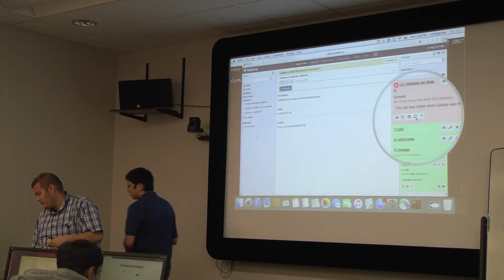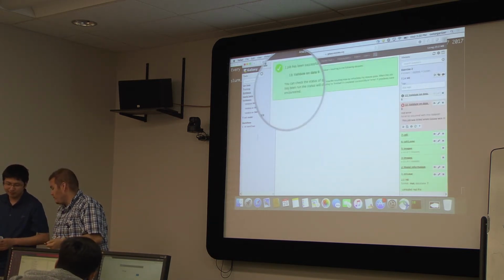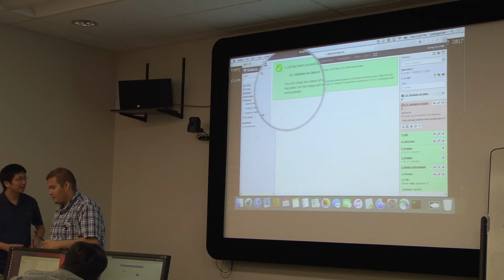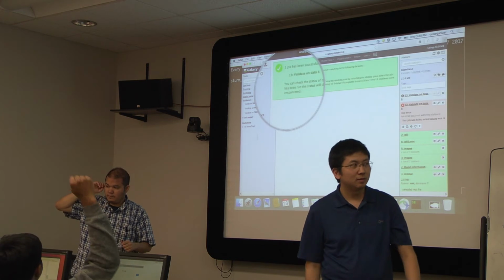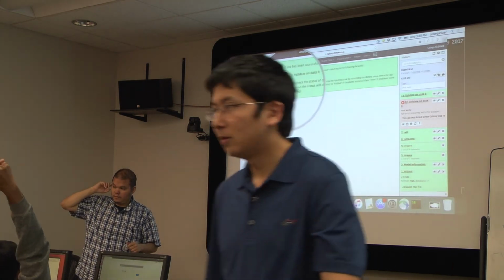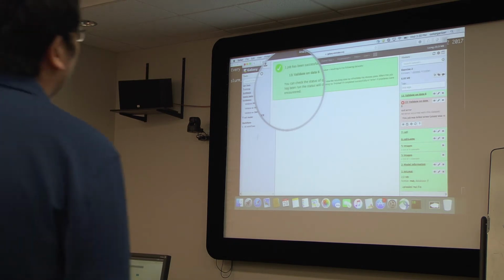So how do we get the XML files back into Wavefront OBJ? Someone got an error? Yeah, that's what we're talking about. Wavefront OBJ files. Of course, they're XML. How did you say to deal with that? Do we just change the file name or what? No. Oh, now it worked.